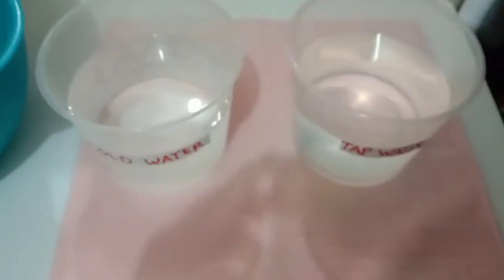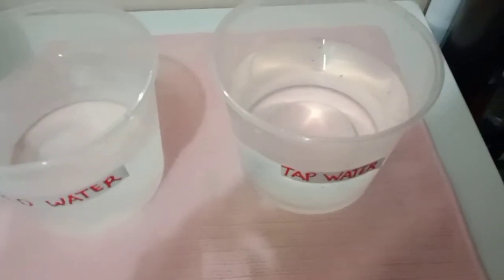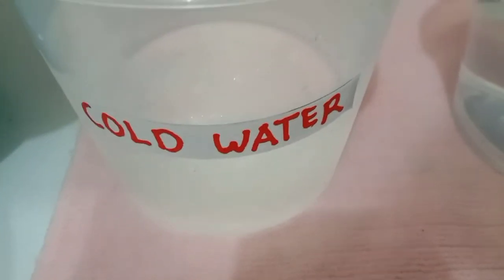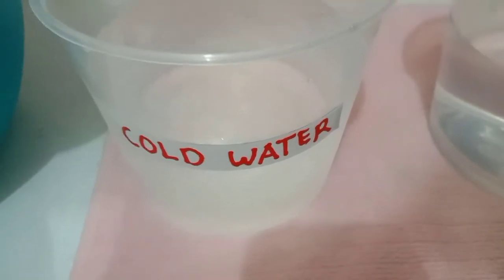So these are the materials that we need in this experiment. The first is 200 ml of tap water. Second is 200 ml of cold water. And we need a fish.